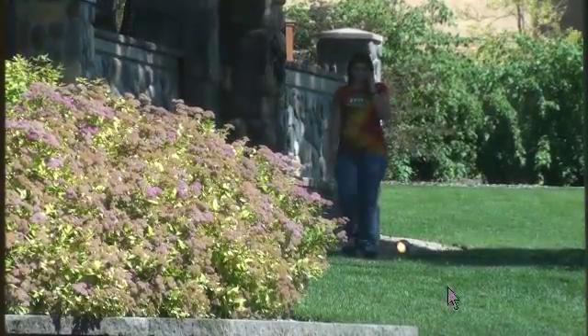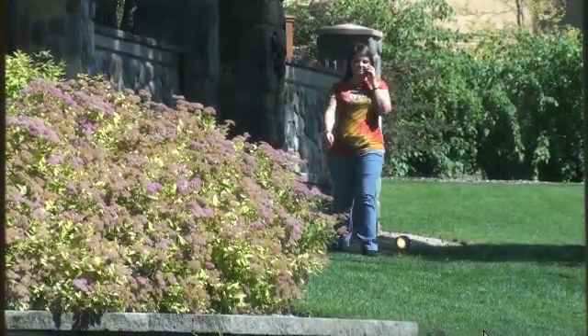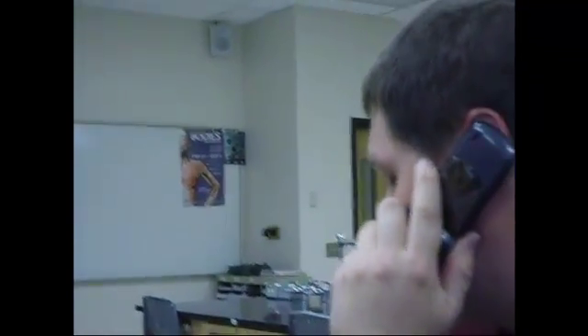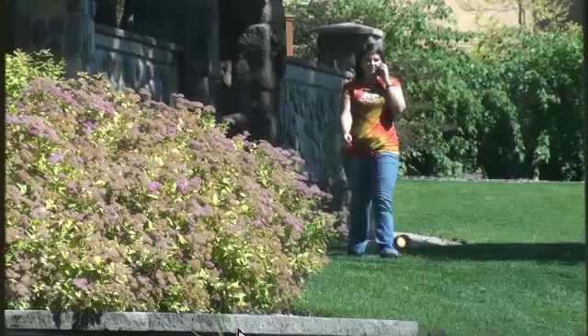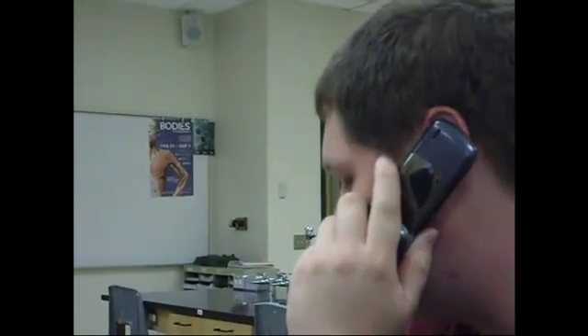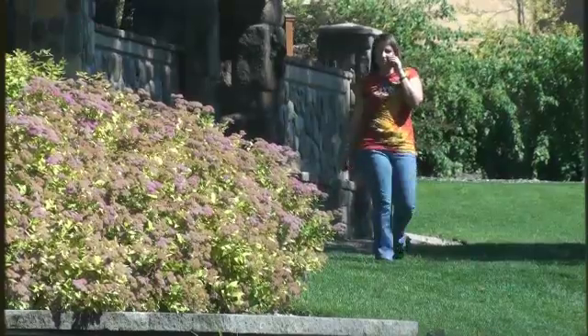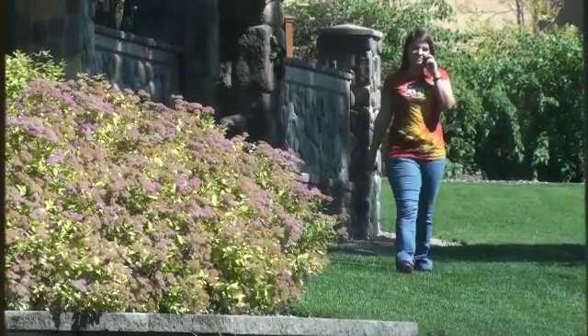Hello? Hey, Stephanie? Hey, what's up? I'm just here in the bio lab, working on the lab for Bio 377. What are you up to? I just got out of class. Do you think you could help me? I need some help with this lab. It's on protein quantification. Okay, yeah, I can help. What do you need help with?